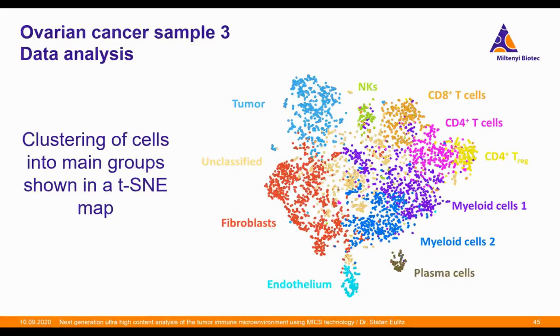But this is, of course, just the surface of the whole information in the dataset, as we have clustered based on 98 markers. Furthermore, the X and Y coordinates are available, and therefore the localization of each cell is also known. And this can also be depicted in the image. This also enables the analysis of interactions, distances, etc., which could also provide useful insights into the biology.